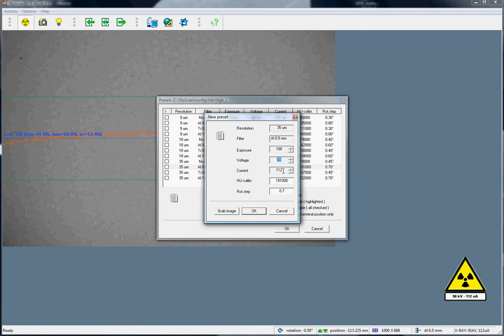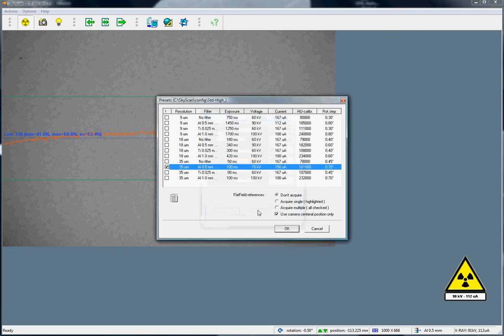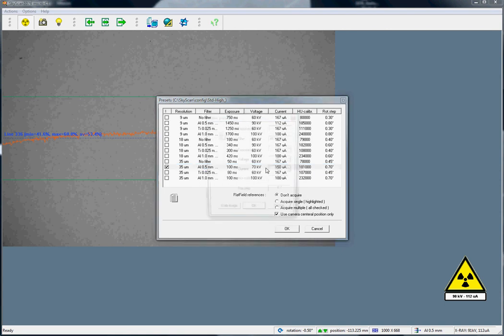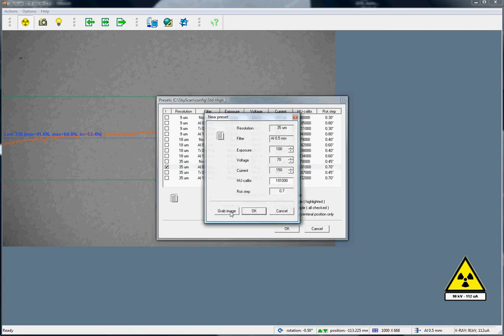We change the current accordingly so that it will reach its maximum value. We put it to a higher value, and it will automatically find the maximum value. We click on OK. We can double click again, and grab an image.